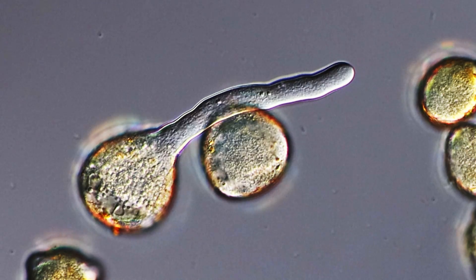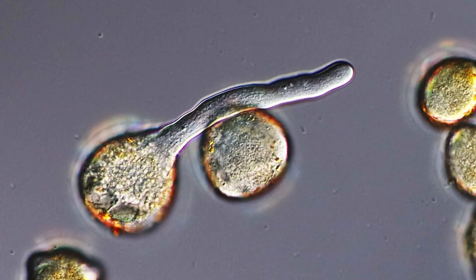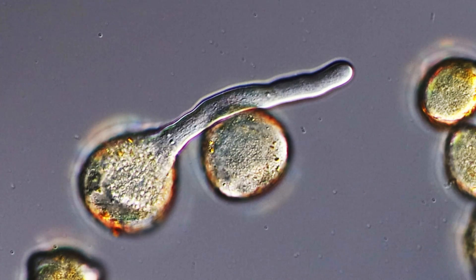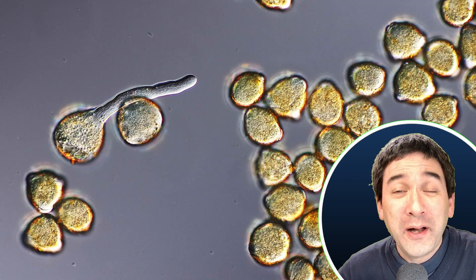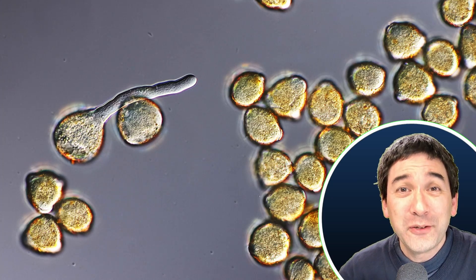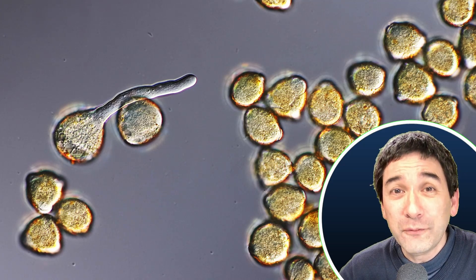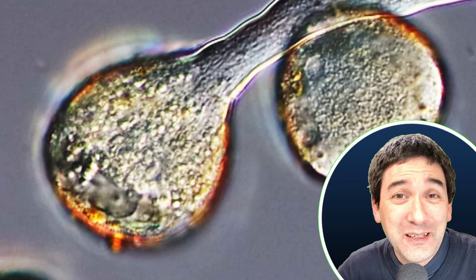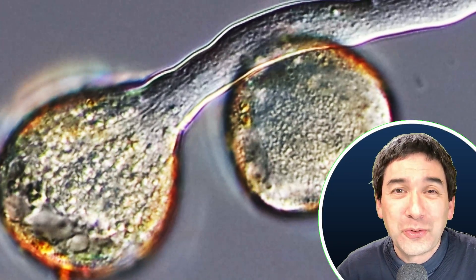I just wanted to share this to show how this important biological process can also be observed directly under the microscope. What we're seeing here is a very important aspect of the reproduction of flowering plants. I recommend that if you go out to collect some pollen during springtime — at least on the northern hemisphere, where springtime is starting again — try different types of pollen and different sugar concentrations. Then maybe you'll be lucky and observe that a few of them will also start to grow a pollen tube.